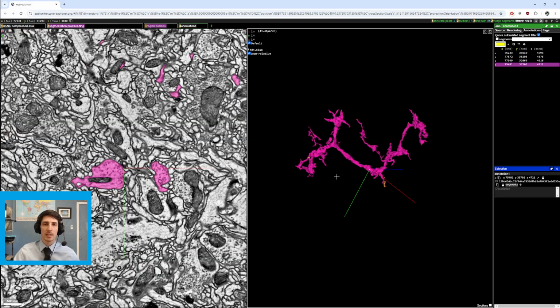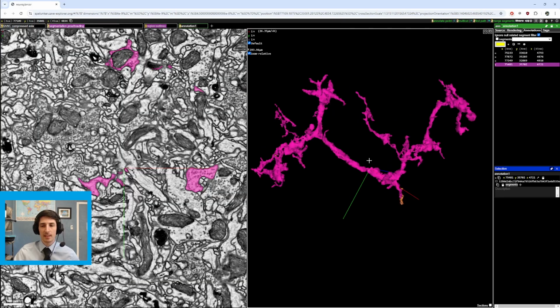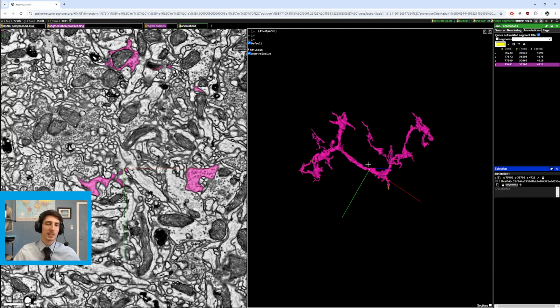So this will be a shorter video, and the reason I say that is because there really isn't much to investigate, but there are key places you're going to want to look, or else you might get kind of stuck looking in the wrong place.